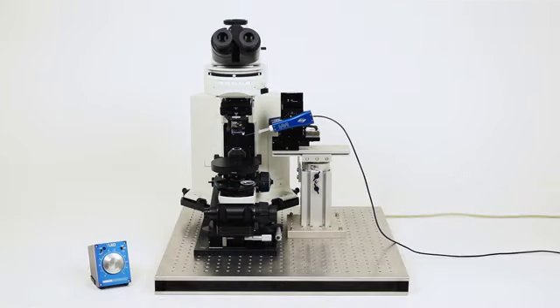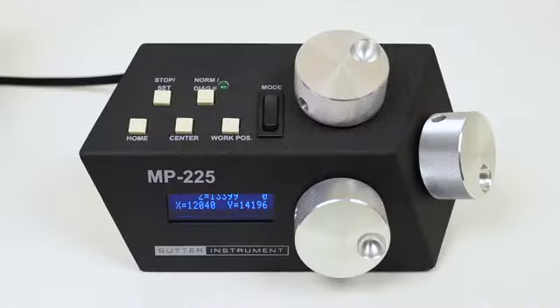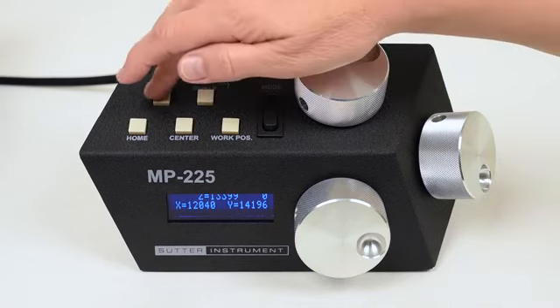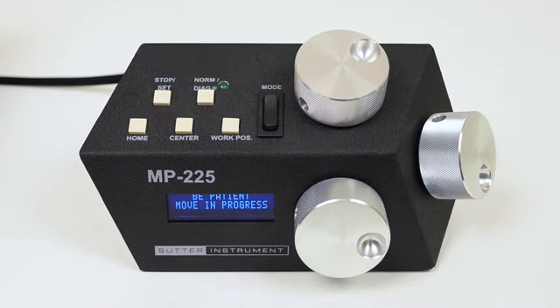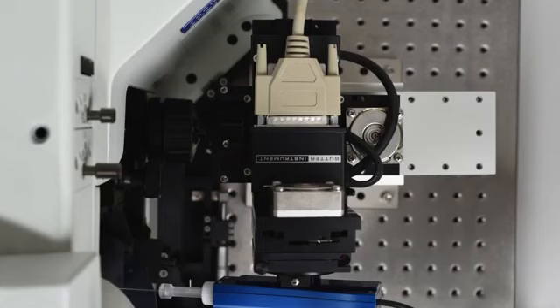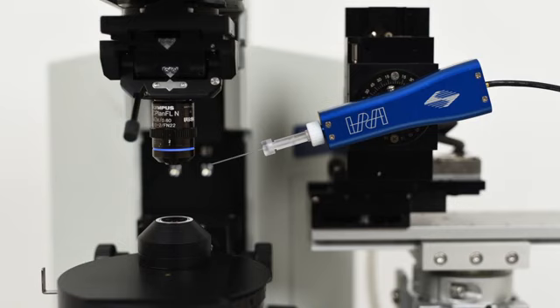To begin, position your manipulator in the center of travel on all three axes. On the MP-225, this can be done by pressing the Set and Center buttons on the ROE box simultaneously. It is generally a good practice to make your work position at or near the center of travel for X, Y, and Z to get maximum travel in all directions under the objective.